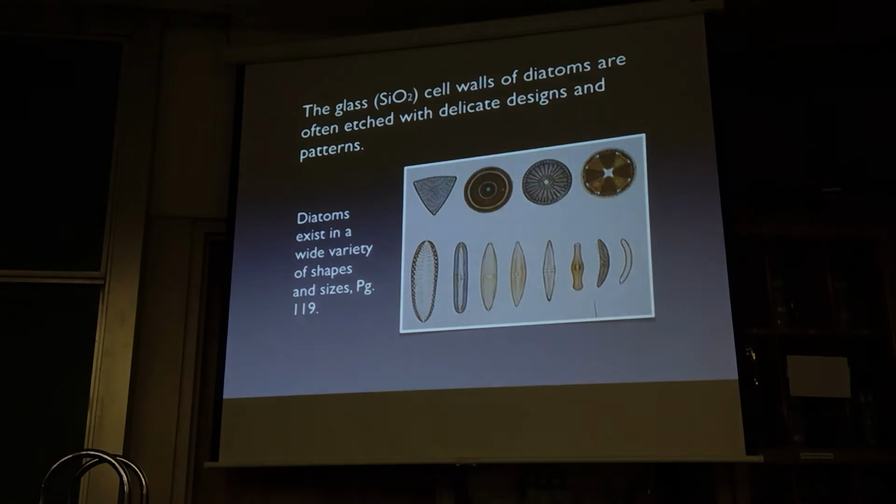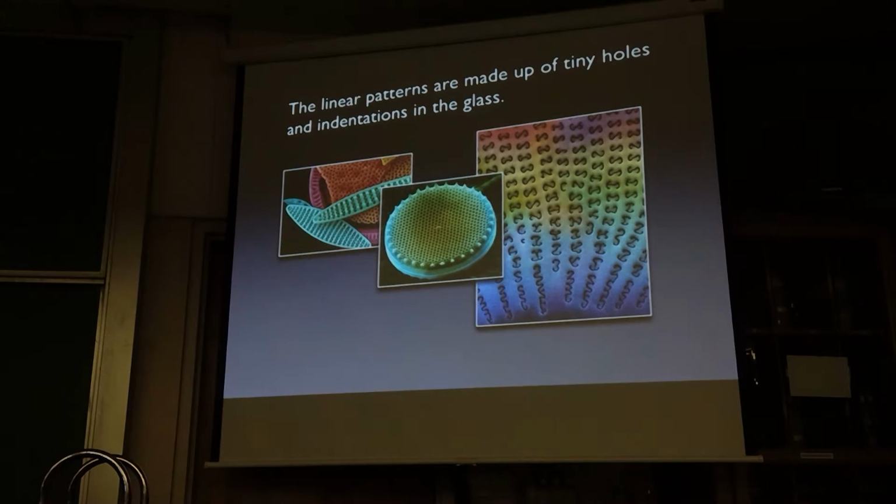So if you look at photoelectron micrographs, they look like that. I try to tell students that image on the right is a secret language. There are these aliens that came down and they've left us a message in diatomese, but we can't read it. We don't know what the heck they're saying. And if you believe that, yeah, anyway, here again, the colors are completely artificial. So this is somebody having fun with color, with electron photomicrographs. They do that a lot.